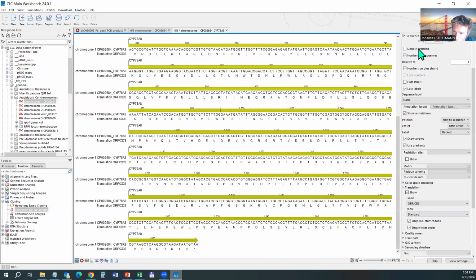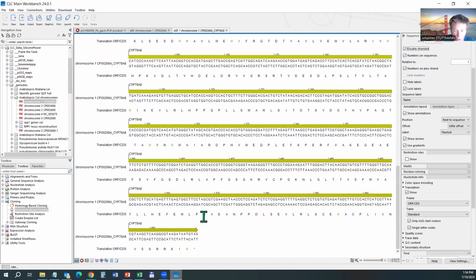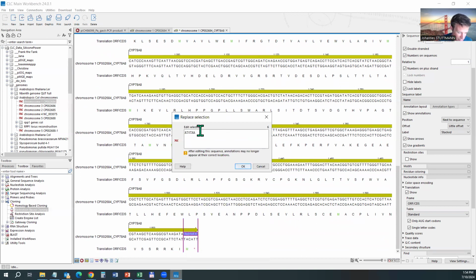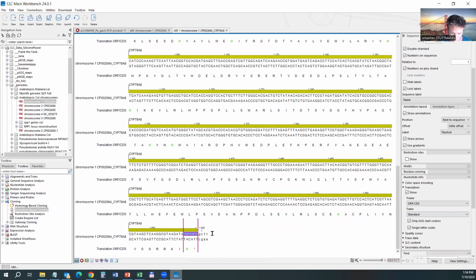I do this differently than last time. So on the right-hand side, it was a GCTT. So I first add this on the top strand, because this is the way I always read these overhangs. Okay, I have GCTT added. Now maybe I have trouble inverting the restriction site and so on. So it's GGTCTCN. So what I can do is I add it on the bottom strand.